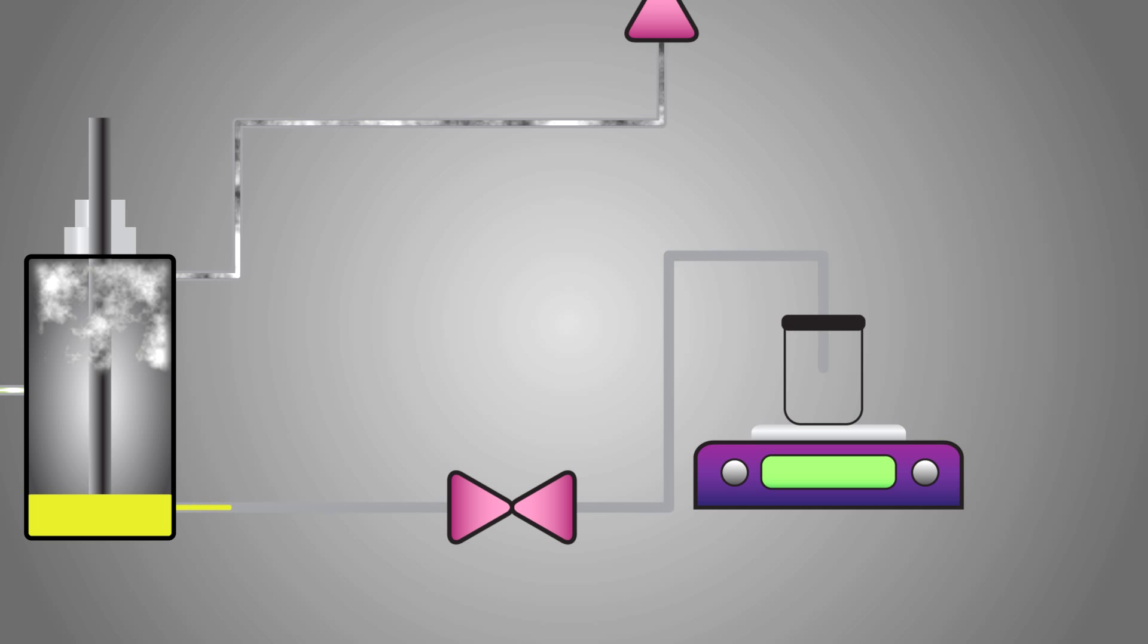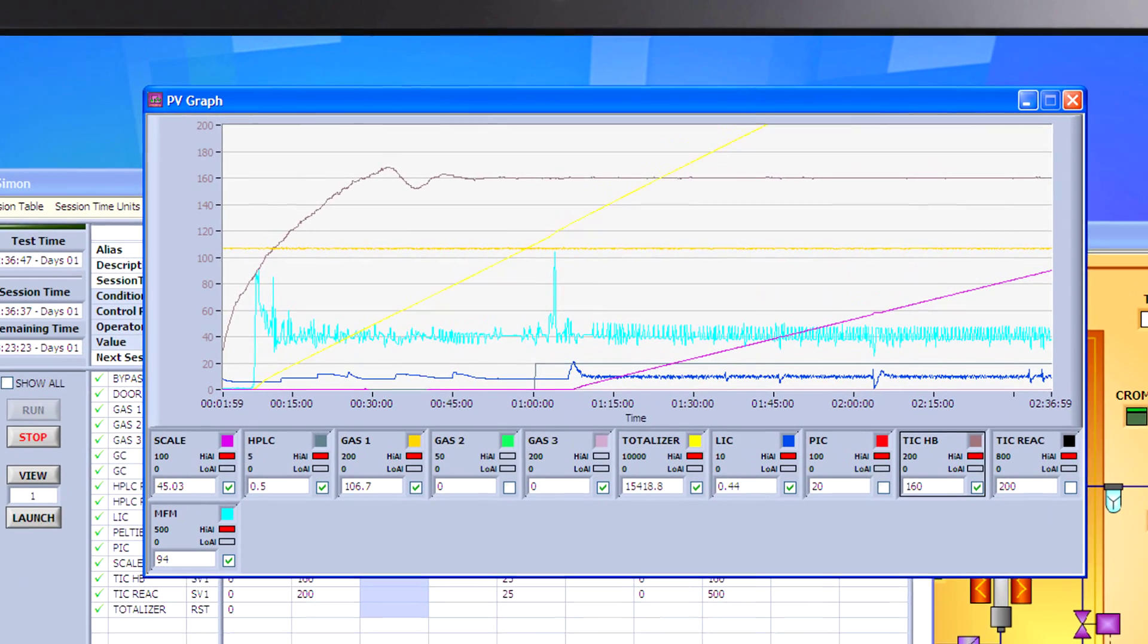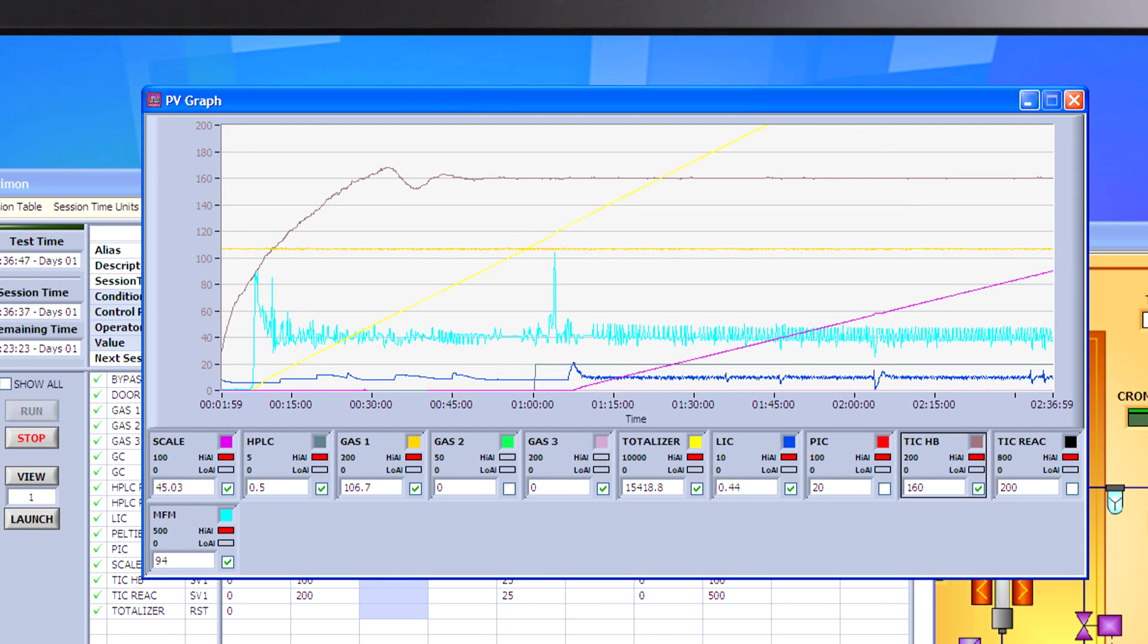A special detector device senses the liquid level, which is sent to a scale for quantification and analysis. The steady increase in weight is captured by a computer documenting how much product was produced in a given amount of time. Both liquid and gas are analyzed continually by a gas chromatograph or by a mass spectrometer to follow the productivity and selectivity of your catalyst.